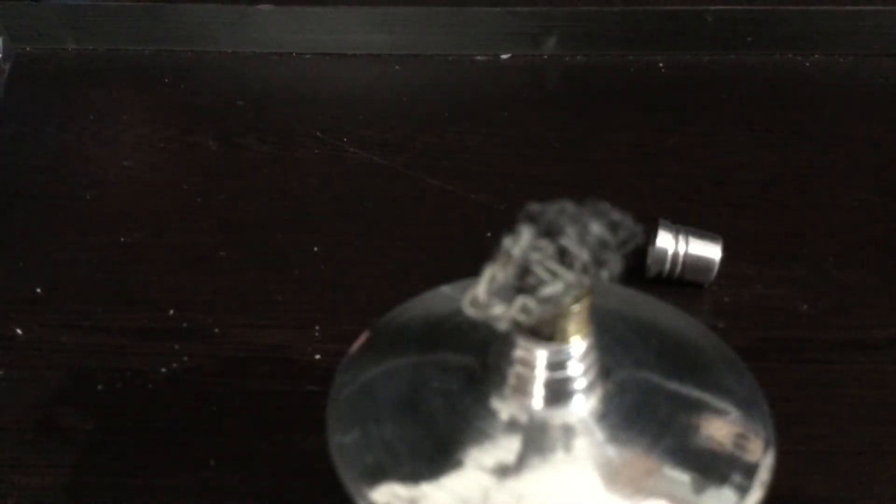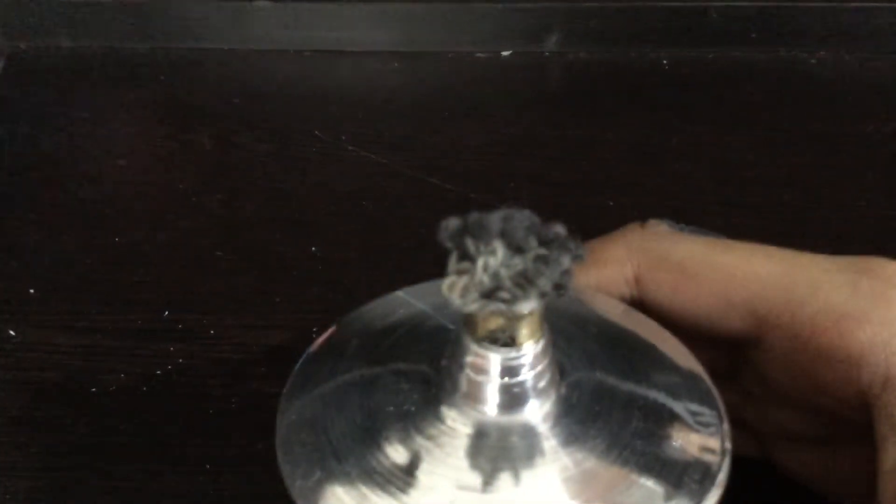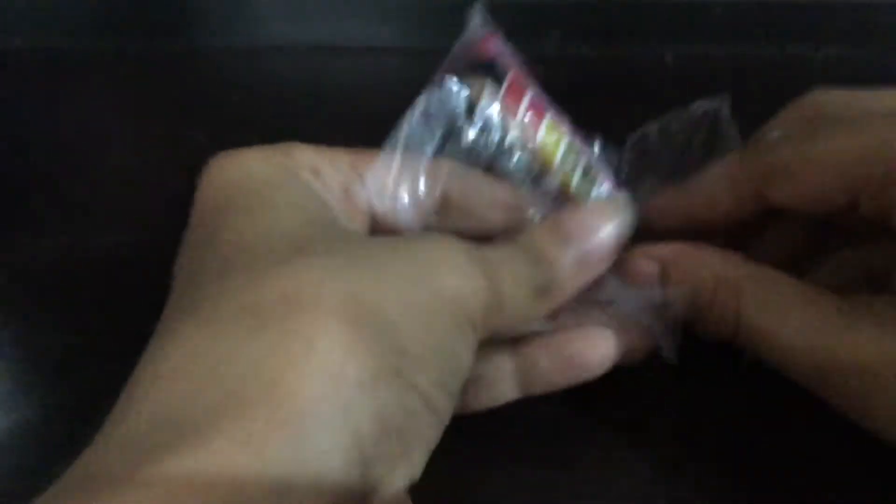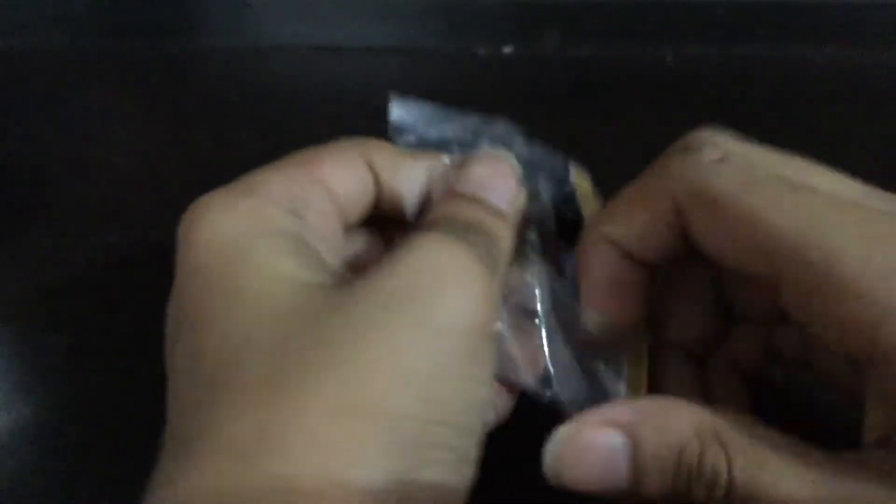Let me put the light on so you can see it. This is the mesh. We'll close this up and keep it aside. The fourth item — I think this is a notepad for marking. This is a noting book where you write down what you are doing in your chemistry experiments. We'll keep it aside and take the next item.